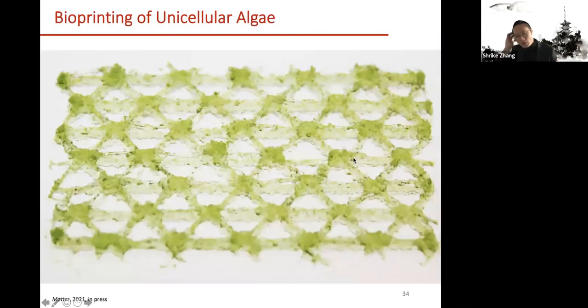So then with that, can you actually apply or adapt these symbiotic approaches that you see every day in our lives to bioprinting and better tissue fabrication, right? So one natural way that we thought was if you can print these plant cells, or in this case, unicellular algae, then they can function as the natural photosynthetic oxygen generator for tissues that you will be able to engineer, right?